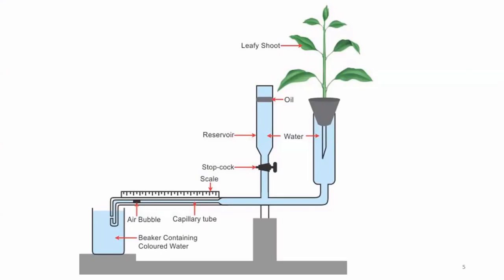So this is the Ganong's potometer setup. First, the whole setup should be submerged under the water.